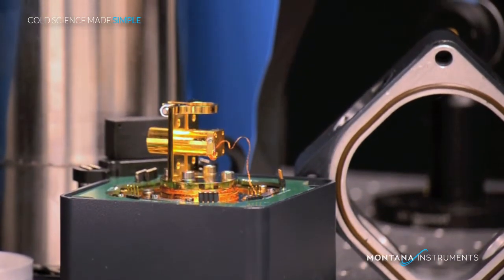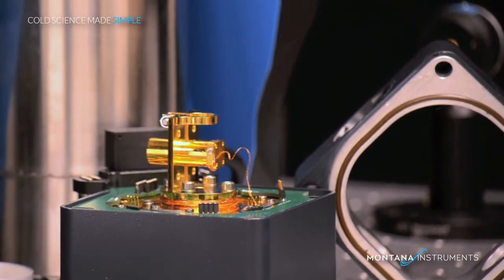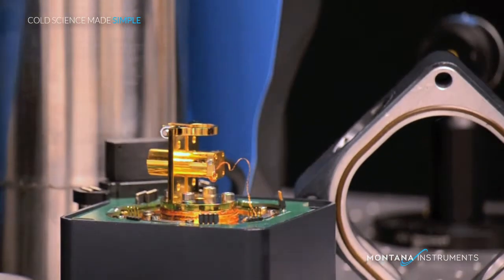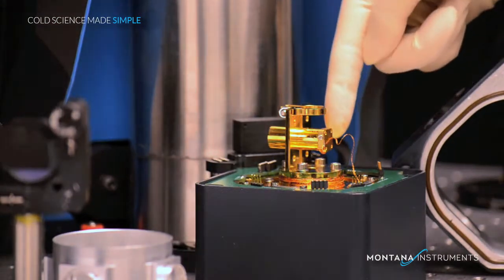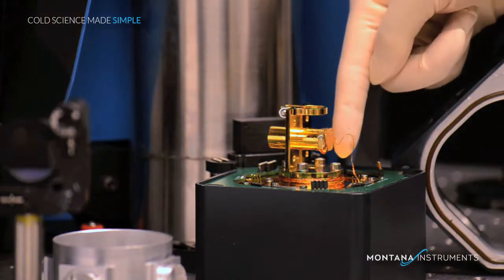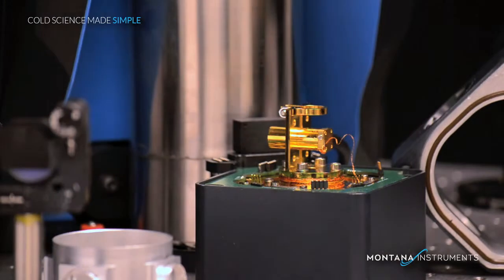Also notice that the entire upper portion of the sample chamber can be easily reconfigured for a unique experimental setup. The sample mount post can be mounted vertically or horizontally to hold your sample and can be positioned all the way up to the window.